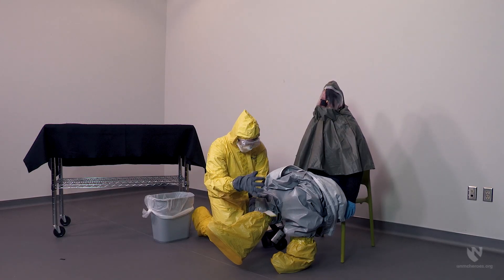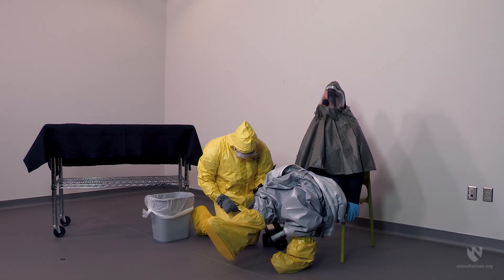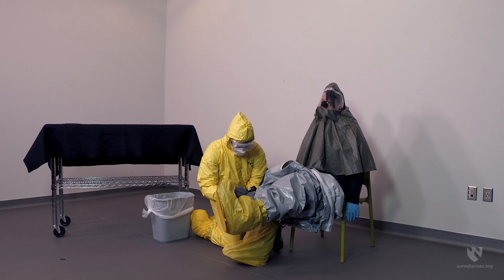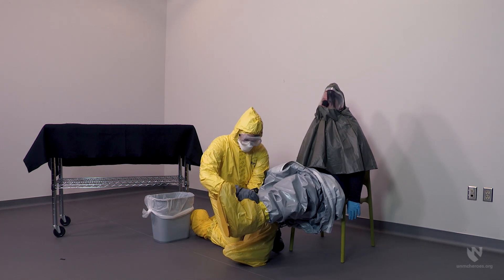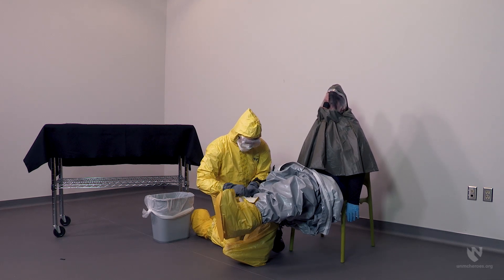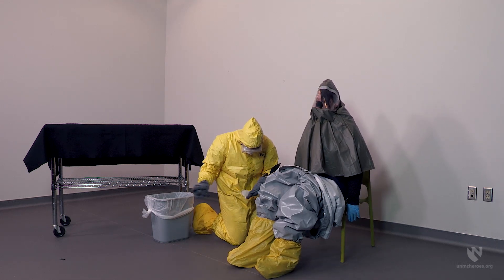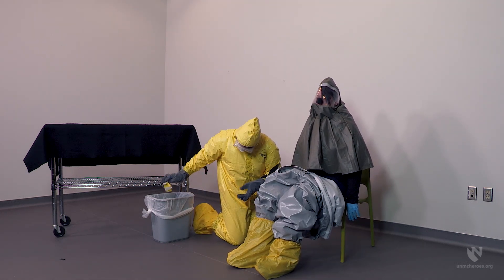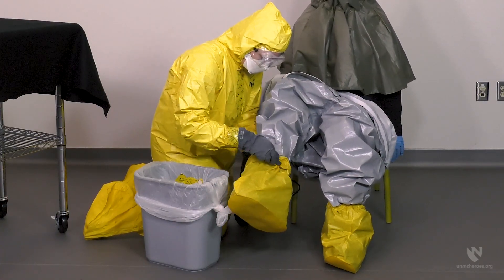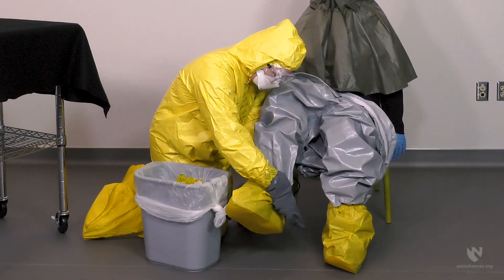Next, the tape at the top of the outer boots should be removed. Remove the outer boots and suit — these can be done individually or as one item.